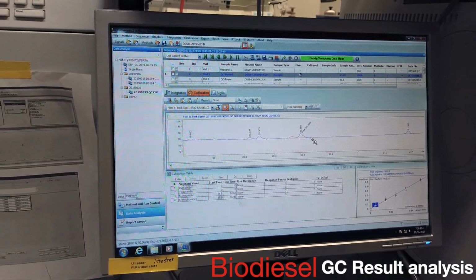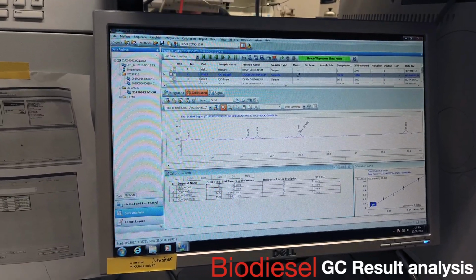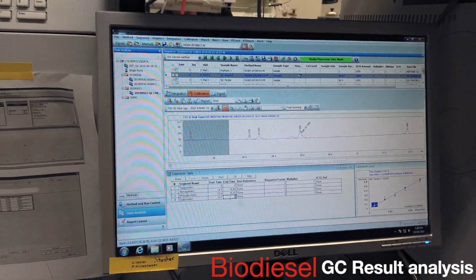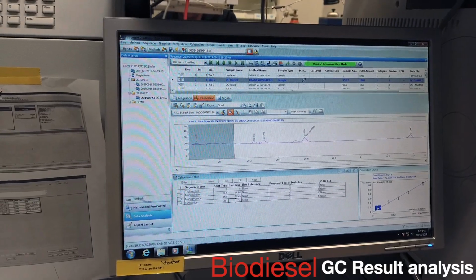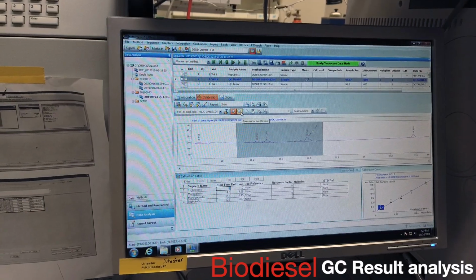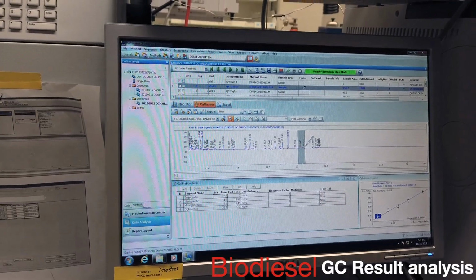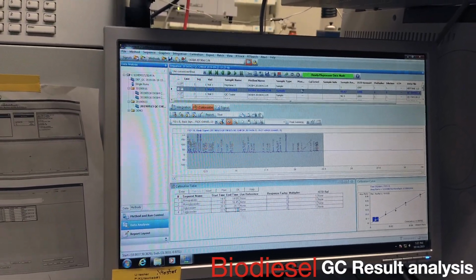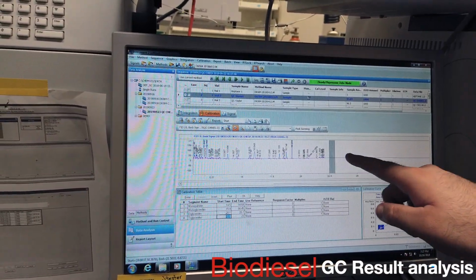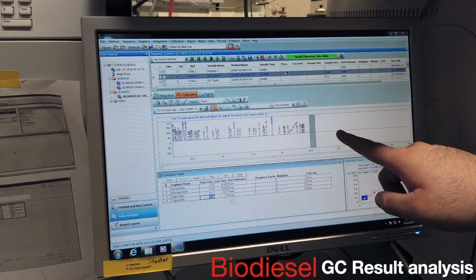And then like diglycerides, I'm going to do this whole thing. So 20.1 to 20.7. So that's good. And then tris would be 22.5 to 23 maybe. So tris is going to be like, if you see two dis, you should see two tris. So that should be really the only thing out there.